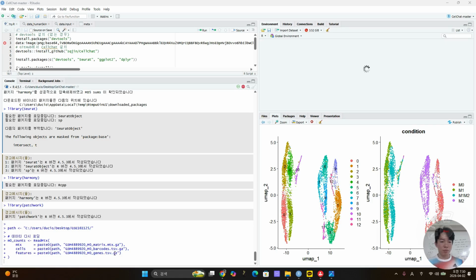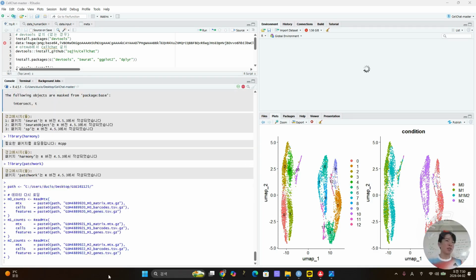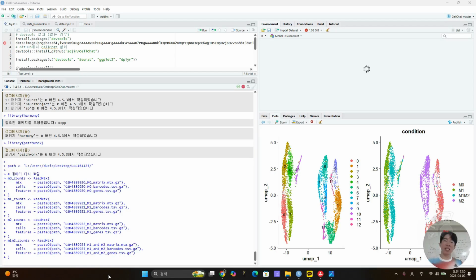So like that, if you have any data set you want to analyze, like single cell sequencing, bulk RNA sequencing, ATAC sequencing, cancer cell survival data, or spatial transcriptomics, any analysis, just ask your AI and then follow their direction. And then you can automatically analyze it.